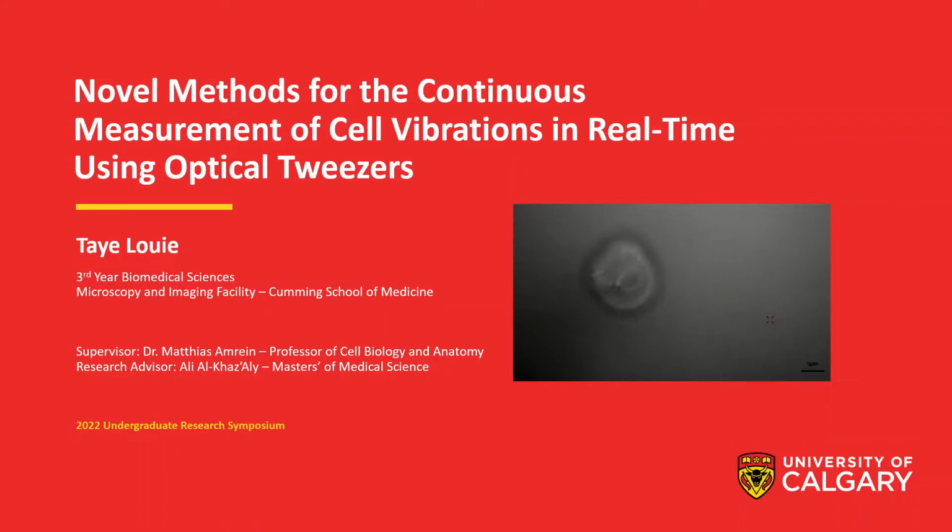Hello, my name is Taye, and this is my project, Novel Methods for the Continuous Measurement of Cell Vibrations in Real Time using Optical Tweezers. Living cells are complex systems that experience morphological changes and exhibit motion as a result of their biological processes. One of these processes, cell-to-cell adhesion, is shown in the video below.